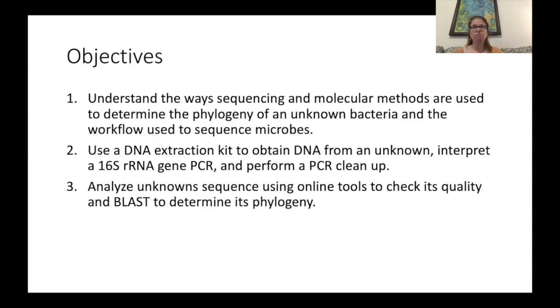Phylogeny is the type of organism, whether that's the genus or the species, in other words, where it fits categorically in the phylogenetic relationship of microorganisms in general. In this case, you're going to get sequence associated with an unknown bacteria, so you'll have no idea what that bacteria is, and also to understand the workflow that's necessary in order to sequence the DNA of microbes.